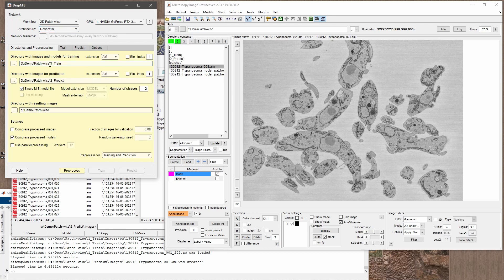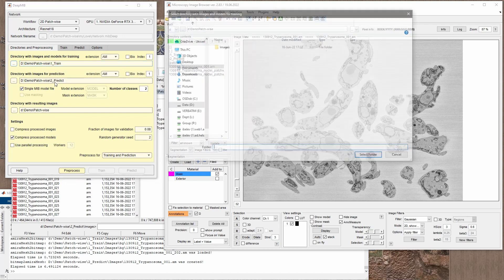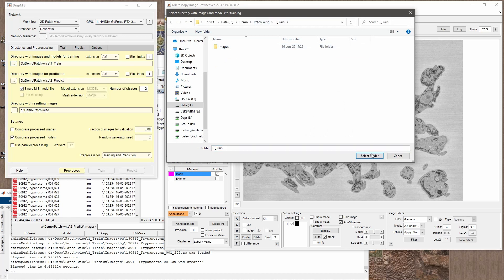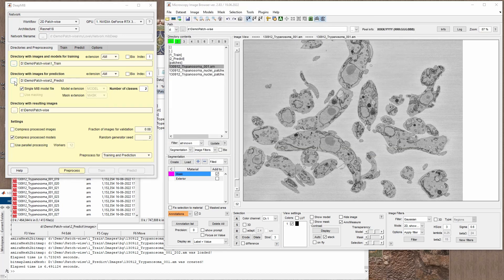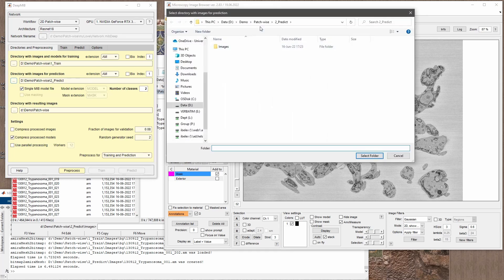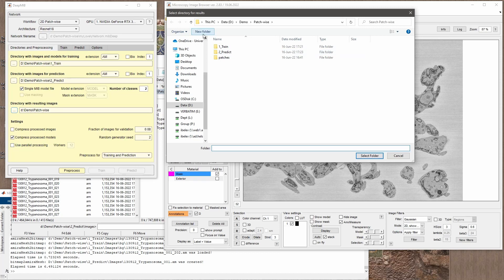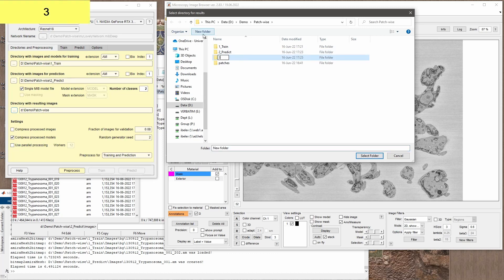In the first step we need to specify the directories where we put the images for training. I go to the patchwise tab, specify the train directory, then the predict directory, and then create a new folder for results.